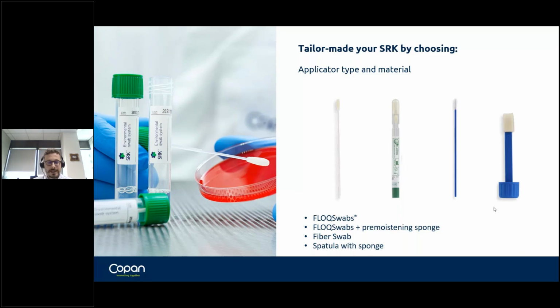And for example, if you are working in a sterile area, this process of pre-wetting the swab can be done very easily with gloves or the garments normally used in a sterile area.